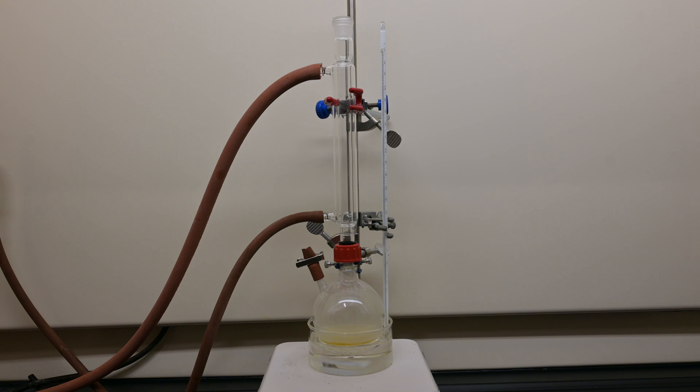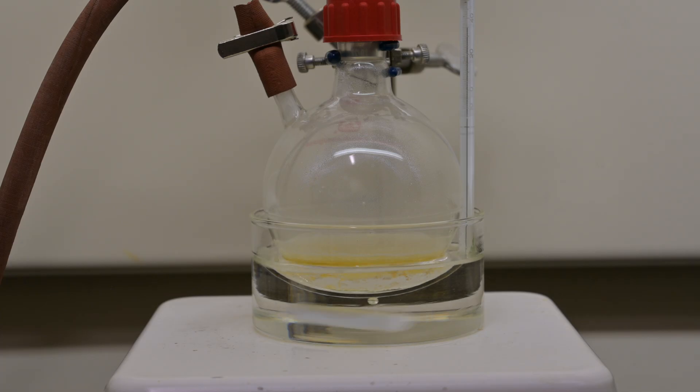Now attach the reflux condenser to our flask and place it into an oil bath. We then heat the mixture at 180 to 190 degrees Celsius for 4 to 5 hours with continuous stirring.